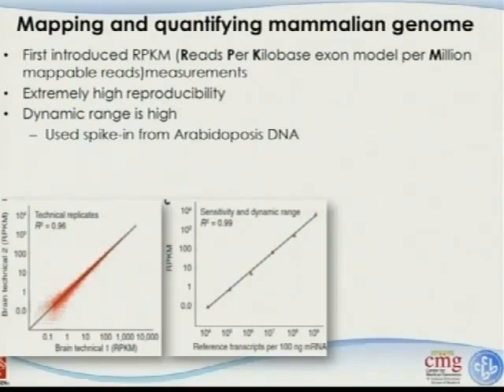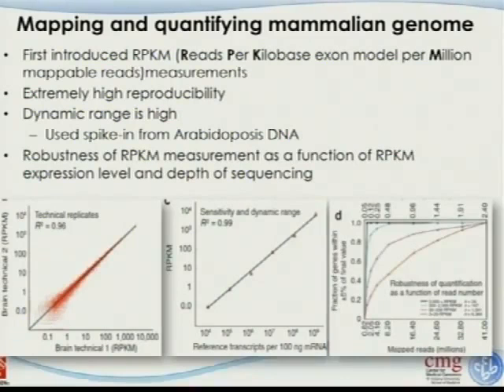Based on this, it's equivalent to 10 to the power 5 transcripts in 100 nanogram of messenger RNA sample, which is very important information.